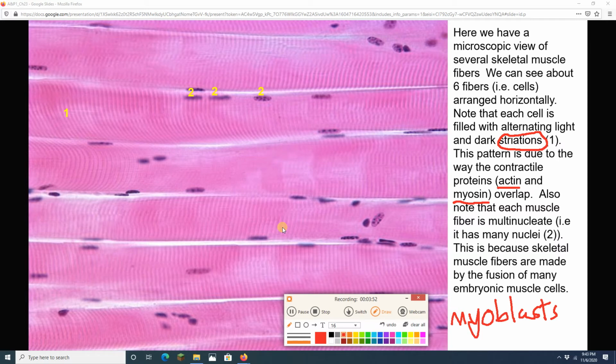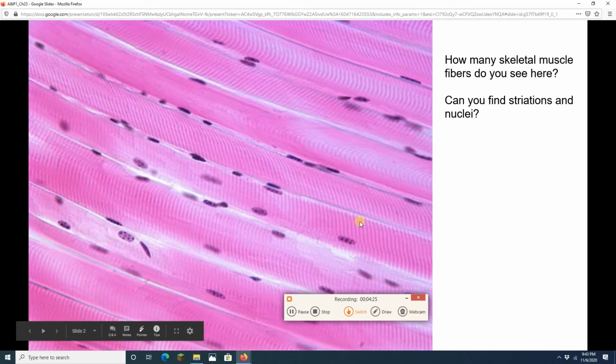And by the way, when we say long, they really are long. I mean, your longest muscle cell basically runs from kind of the front of your hip to the inside of your knee. So imagine drawing a diagonal line from like your pocket at your hip all the way down to the inside of your knee, and that's the length of your longest muscle cell, which is pretty long. All right, this is one histo slide that is done. Let's go ahead and do another one.